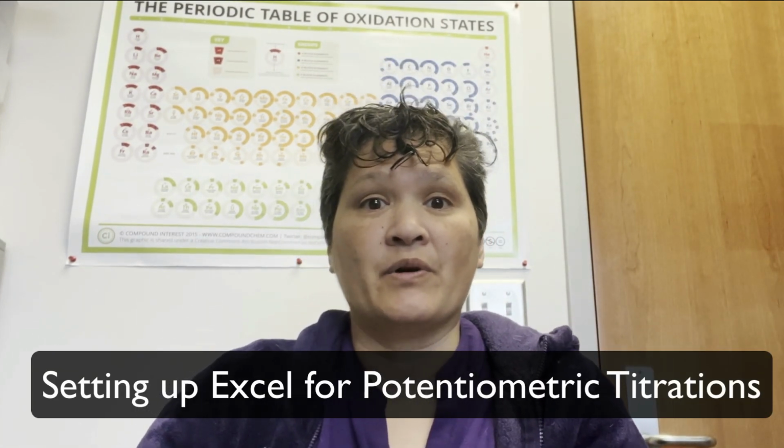In this video, we're going to talk about setting up an Excel sheet for potentiometric titrations. This video is specifically made to help my Chem 242 students process their data in labs 8 and 9. I'm going to walk you through making 3 different graphs: a basic titration graph, plus the first and second derivative graphs. And we're going to talk about how to use them to find your equivalence point.